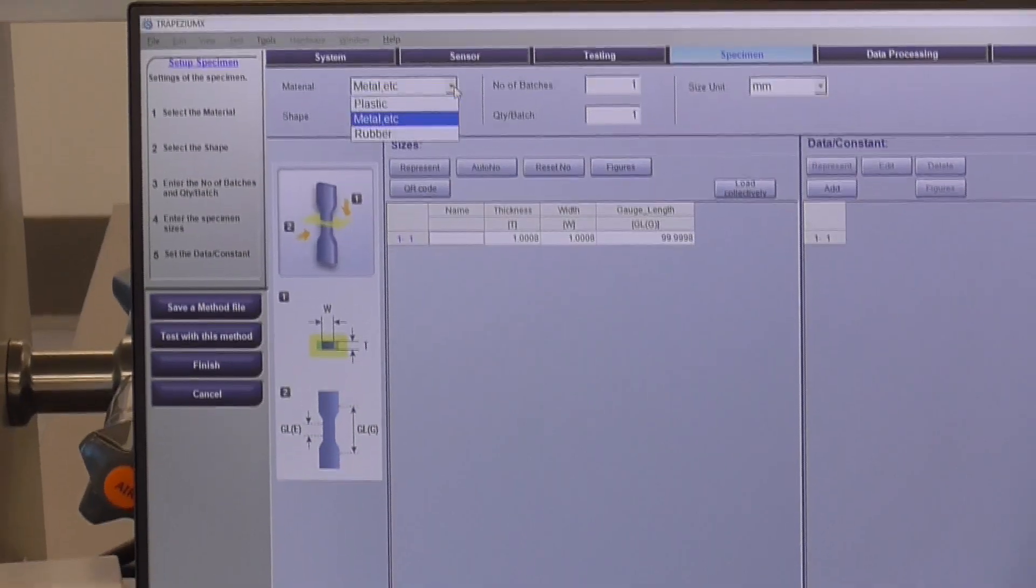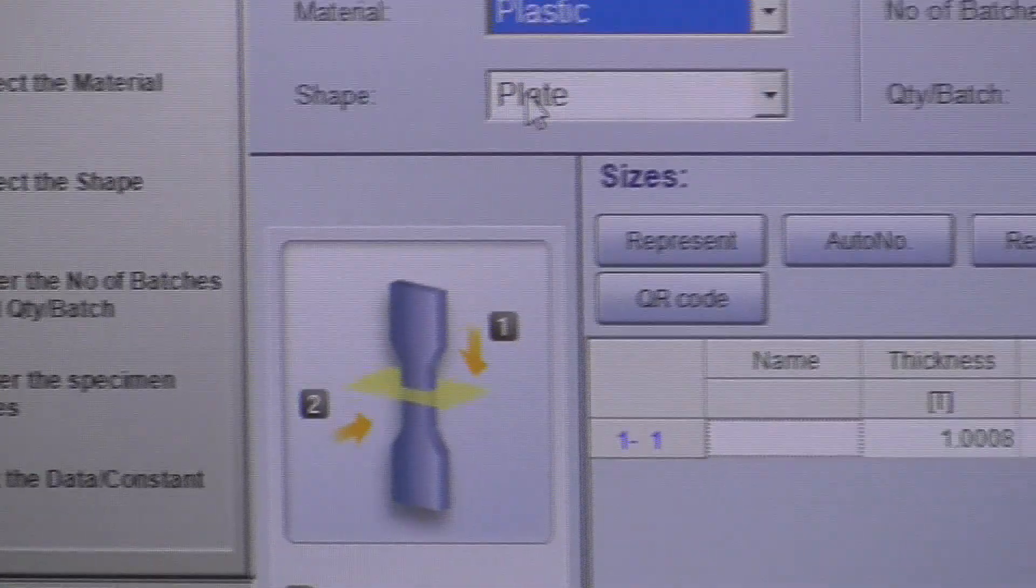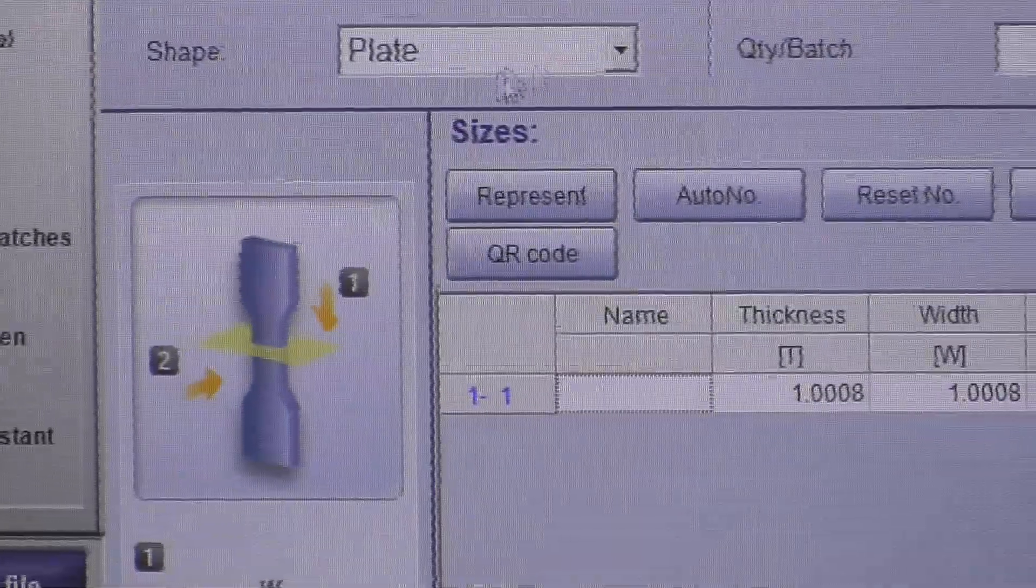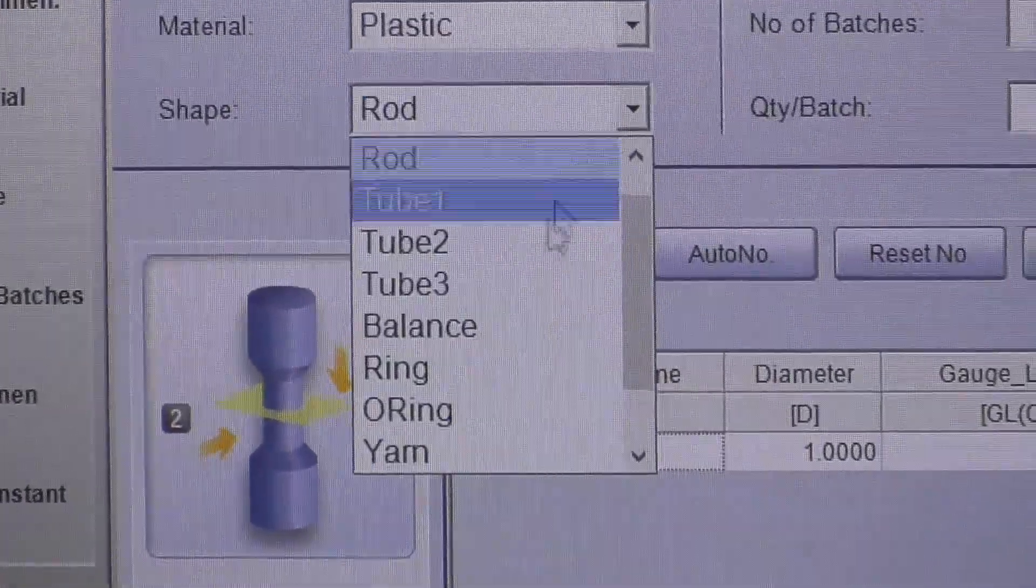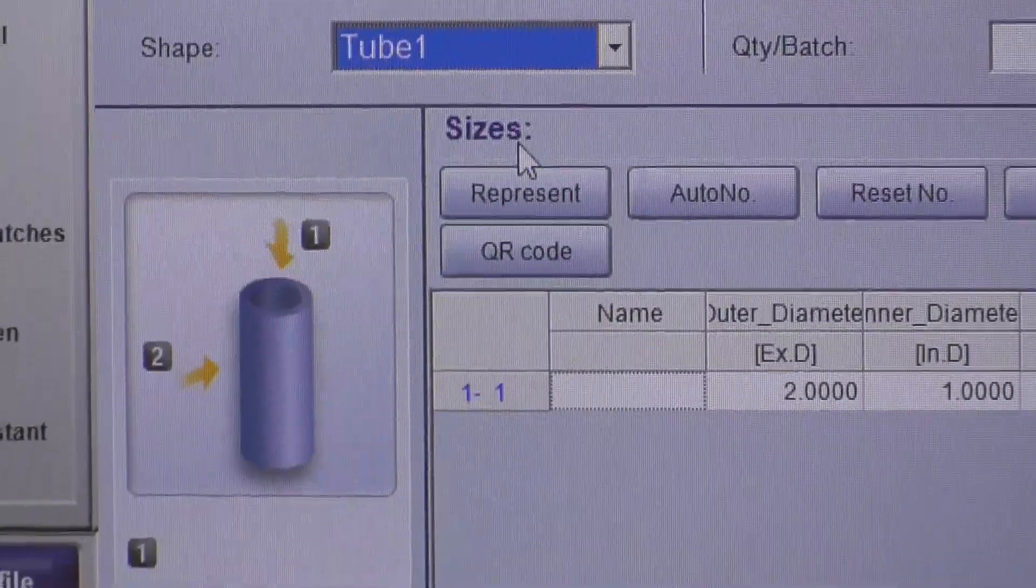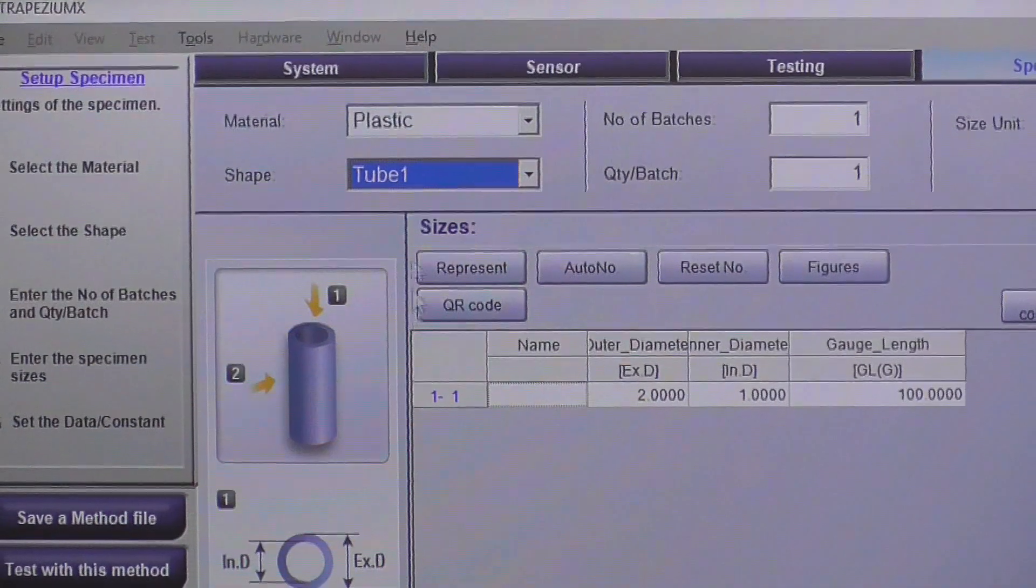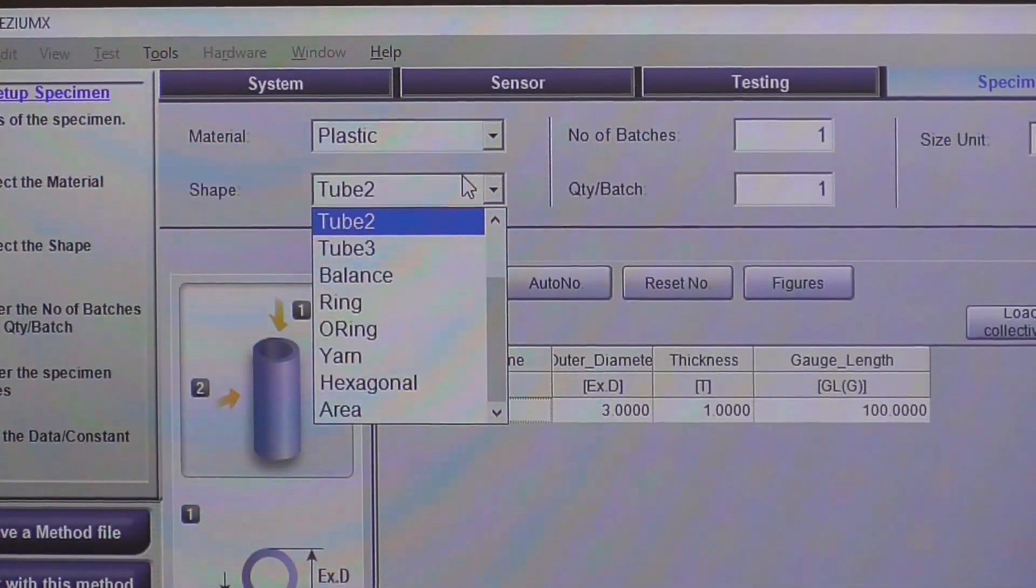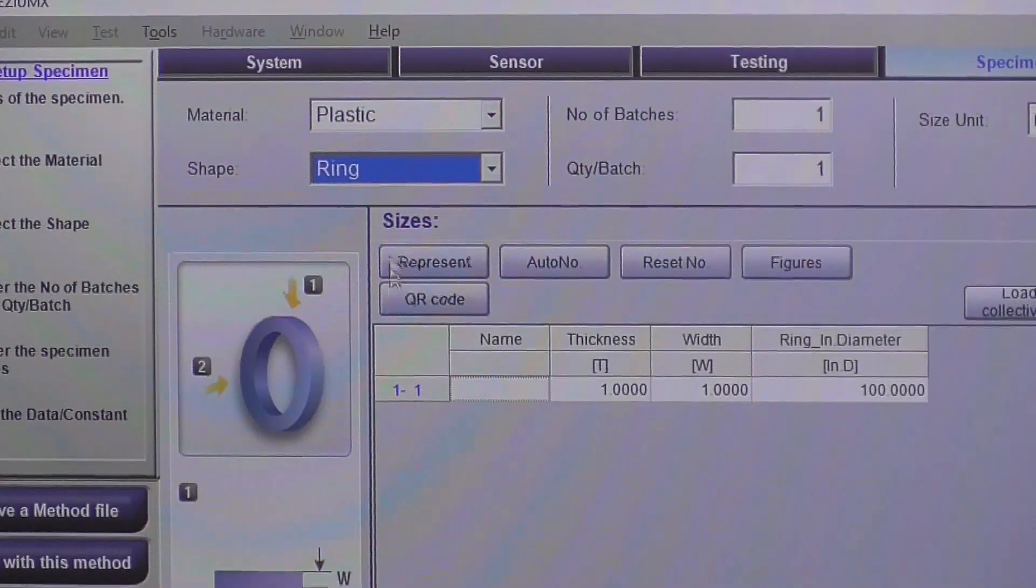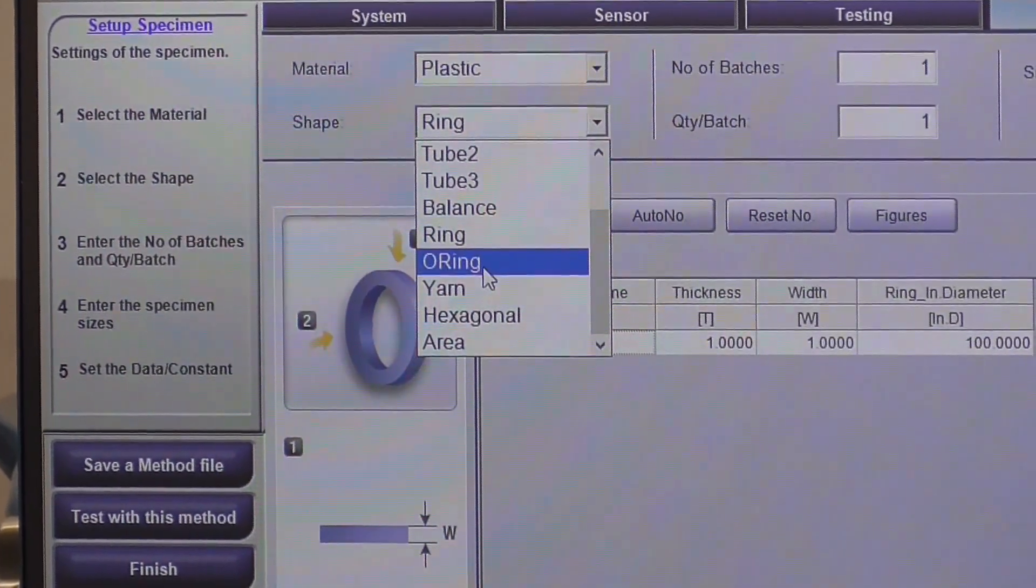In addition to the material type, you can do your sample shape. So the plate, this is showing a typical dog bone right now. Rod, a circular cross-section. Also tubes, you can define your tube dimensions as an inner diameter and outer diameter. You can also do outer diameter wall thickness. You can also compress rings as well, or pinching rings as well.